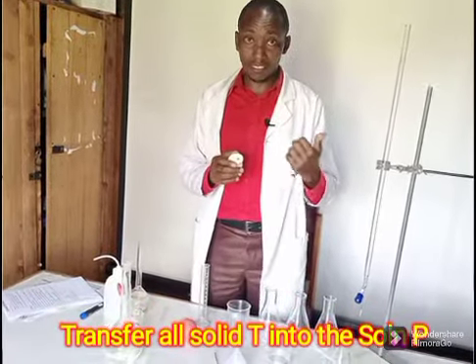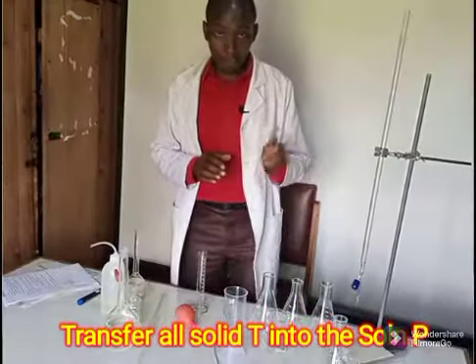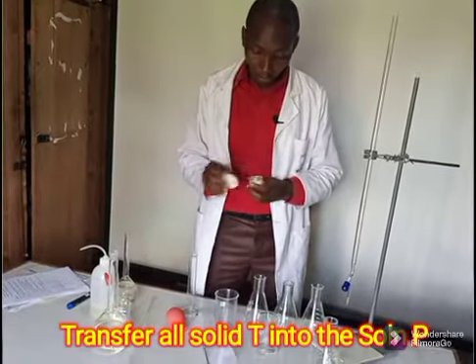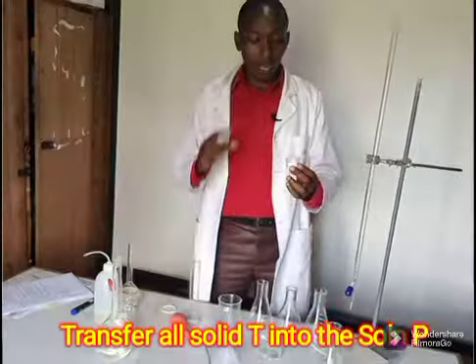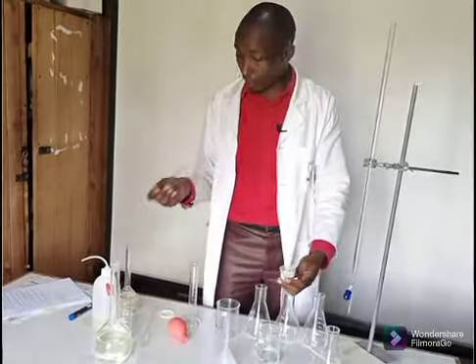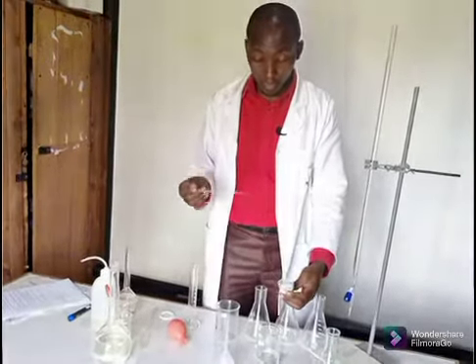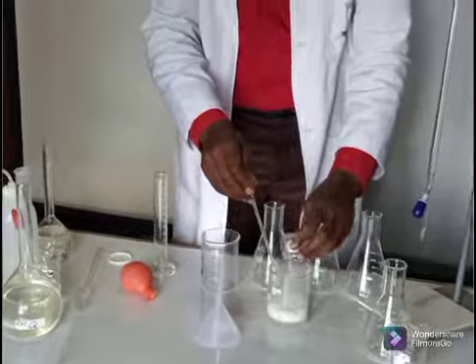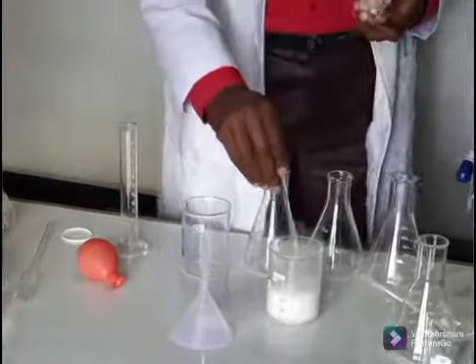The next step, step number two, I take solid T and I empty all of it. Remember, this is quantitative analysis, so every amount matters a lot. So I'm going to empty all solid T into the acid that I have. But remember, P is 2 molar HCl.